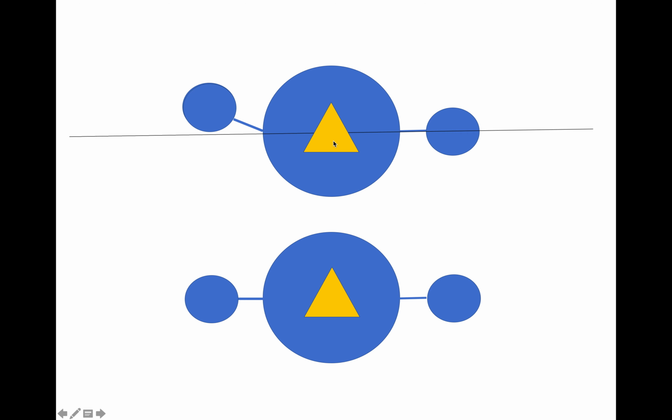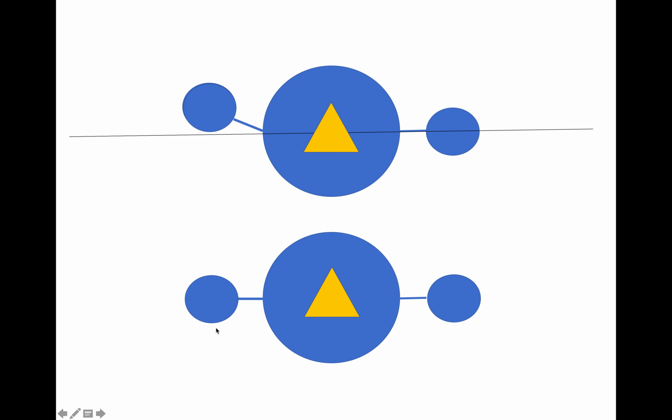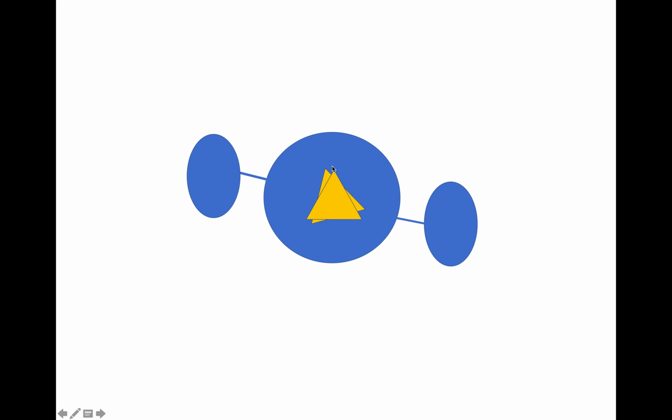Now what we might have is, because these regions are flexible, one region being perfectly in a line and then another domain being slightly off. And what we'll see is that without a mask, the alignment of those two might result in something like this, where the offset of this domain, let's say on the left, might influence the center to be slightly off later on, right?